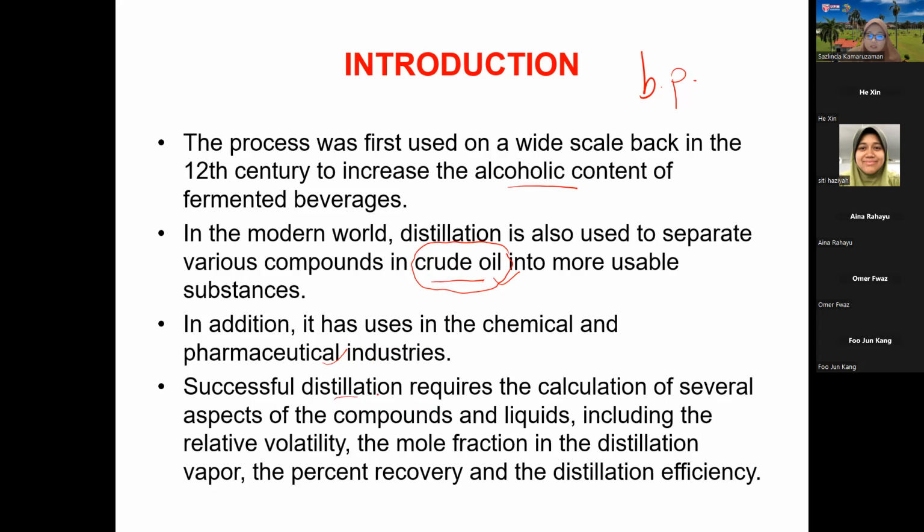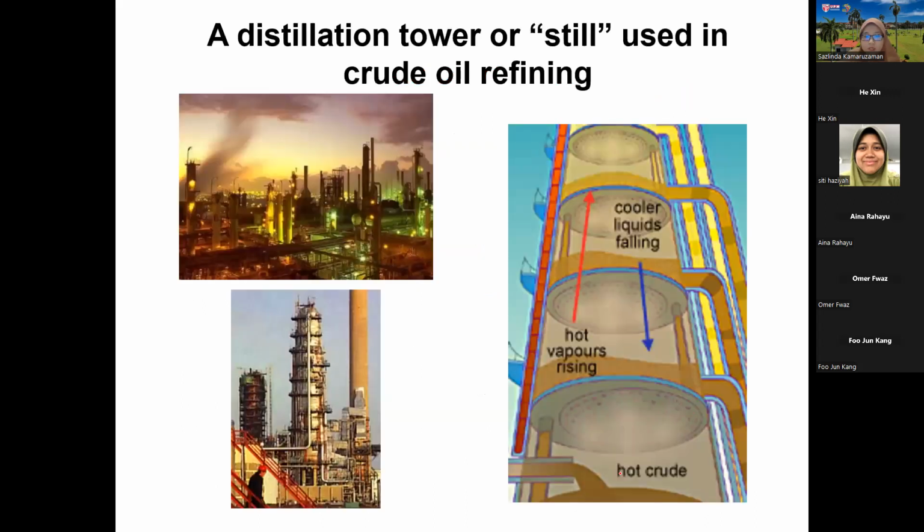Distillation involves several calculations, but in this syllabus we don't focus more on the calculation. It's more towards the theory and the basic principles of the apparatus. Usually in distillation it is important to know about the mole fraction, so how much of the fraction or mole of the liquid will be converted, and from that we can calculate the distillation efficiency. Because separation is about purification, for example how much we can purify the liquid from the mixture, so certain calculations are involved. These are the examples.